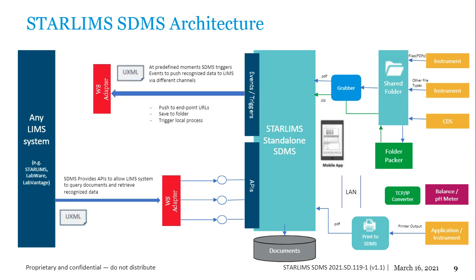Now let's move on to the left-hand side. Getting that information into SDMS is part of the actual solution. But as Pradeep has mentioned, it can act as a middleware and push this data out to any other LIMS system. So on the left-hand side, we can look at the events and triggers mechanism, and how we push this event data to the LIMS. Once the information is captured within our SDMS, we can look at how SDMS can raise events that can be transmitted to any generic LIMS.